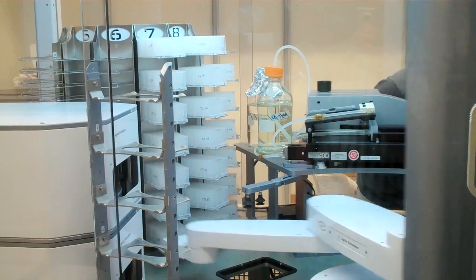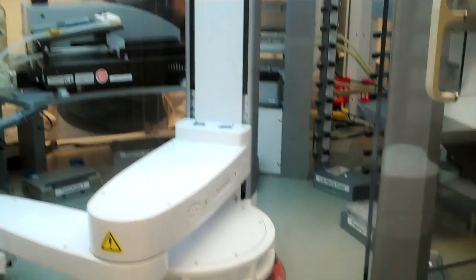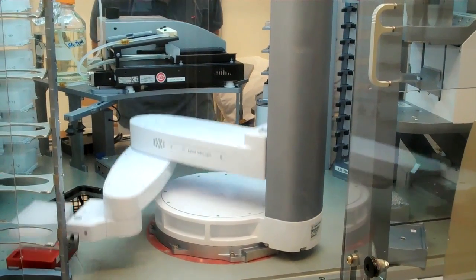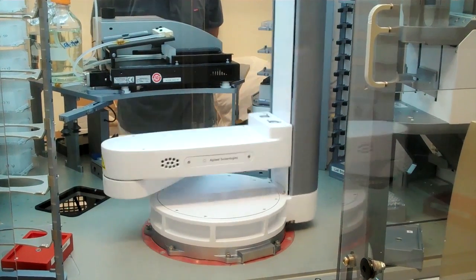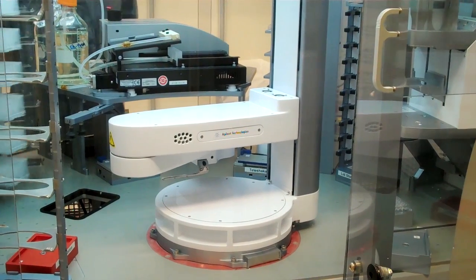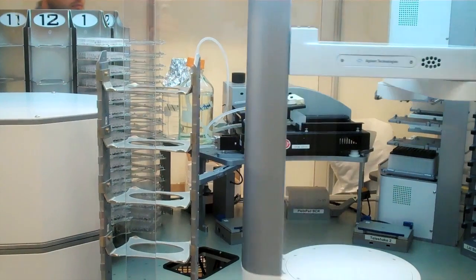So what you can see on this robot platform are stacks of microtiter dishes. They're essentially plastic plates that have lots of little wells in them. One of those stacks of plastic plates contains yeast cells which harbor a plant transcription factor. These transcription factors are the on-off switches of the plant genome.